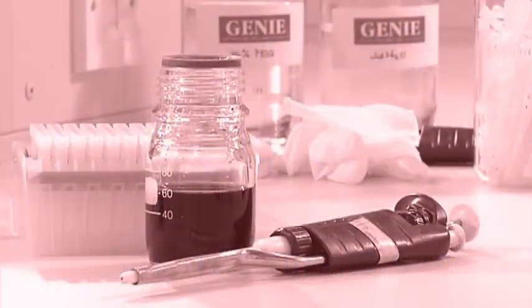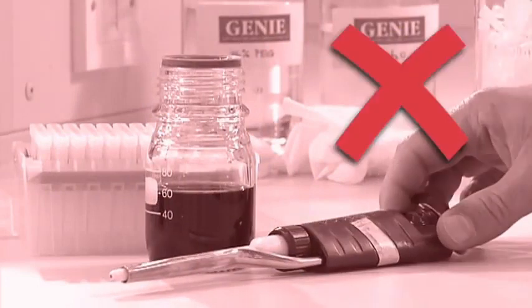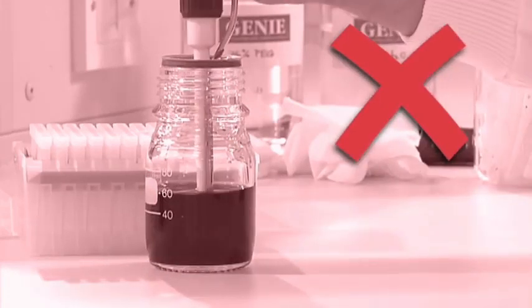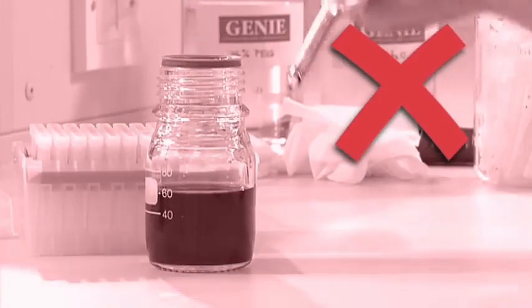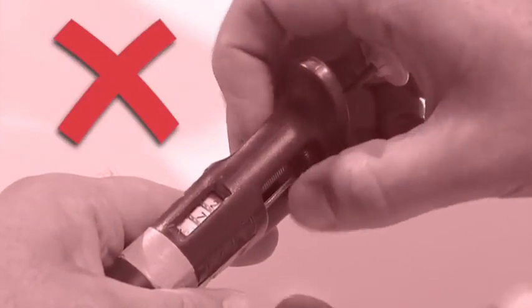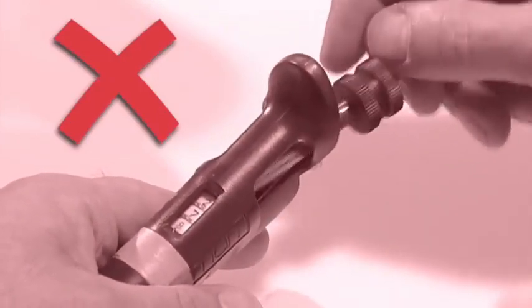Do not use a pipette without a tip attached. Liquid should never enter the body of the pipette. It will cause the pipette to corrode and will be a major source of contamination between liquids and experiments. Do not use a pipette past its volume limits. This causes pipetting inaccuracies and also damages the pipette.